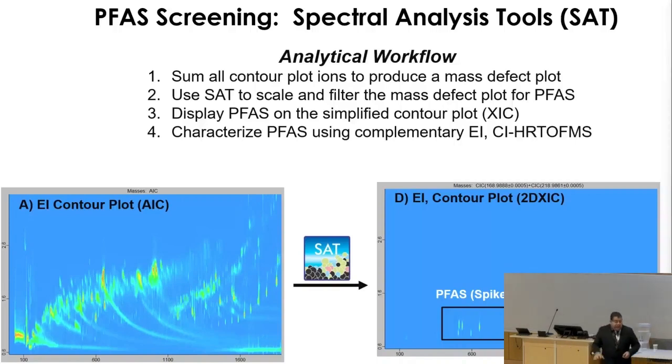I don't have that kind of time. Even though I have powerful filtering tools, I have the power of high resolution accurate mass. I know where these compounds tend to split, and I know how to target these, but that's too much of a pain. So what I wanted to show you is how we screen for this easily.